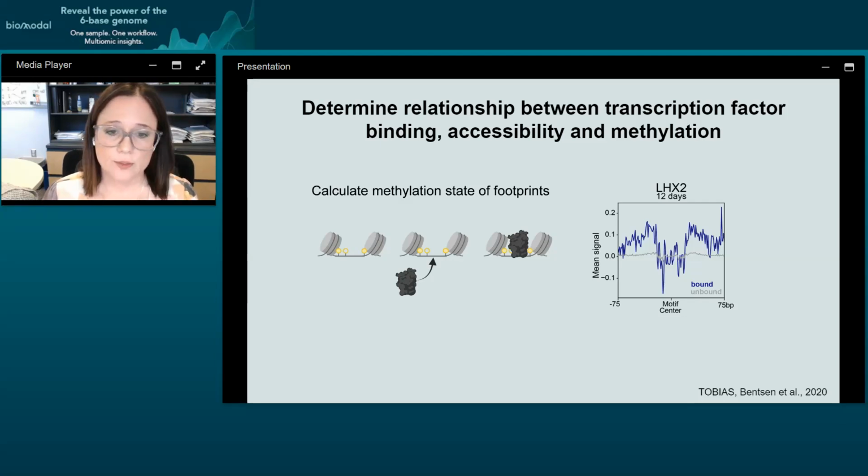So if there's a transcription factor bound, this provides a protection against Tn5 cutting within the transcription factor bound site, so you can calculate the number of cut sites around these accessible regions to determine the actual footprint that's there, and then you take the sequence motif that's underlying the footprint to determine which is the likely transcription factor that is bound at the footprint.